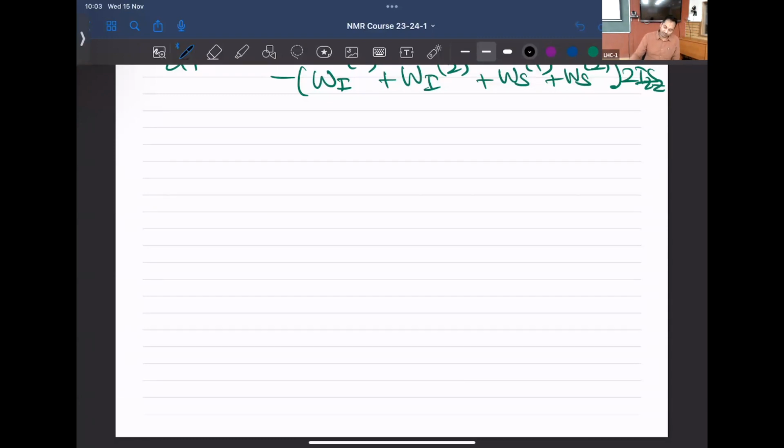Since we are in the last week of classes, let's once again start with the questions that you may have. And most importantly, what we have to get done is to understand how NOESY and other 3D experiments would help you get the structure of a protein. That's the overall exercise. Unlike the other parts of the course where we were extremely quantitative, for these classes, I'm going to be quite qualitative, except for the discussion of the Solomon's equation.